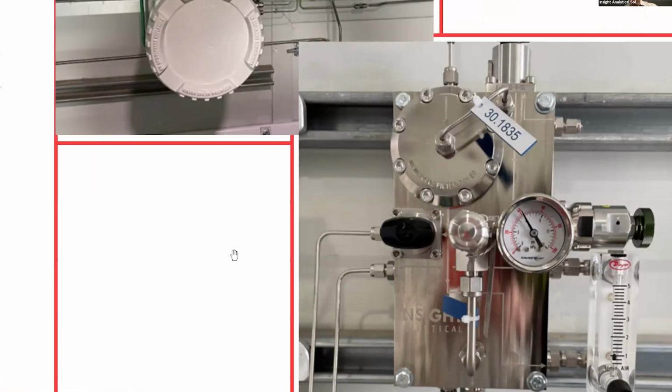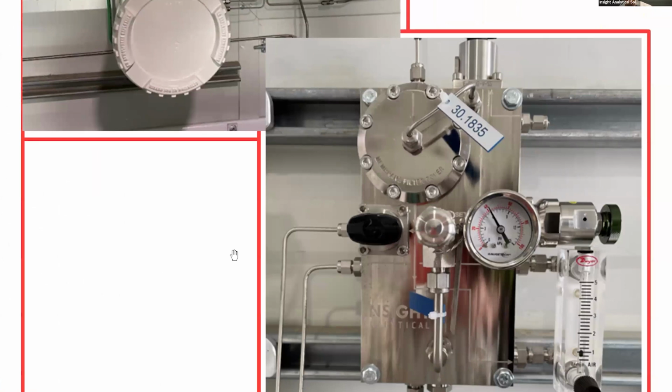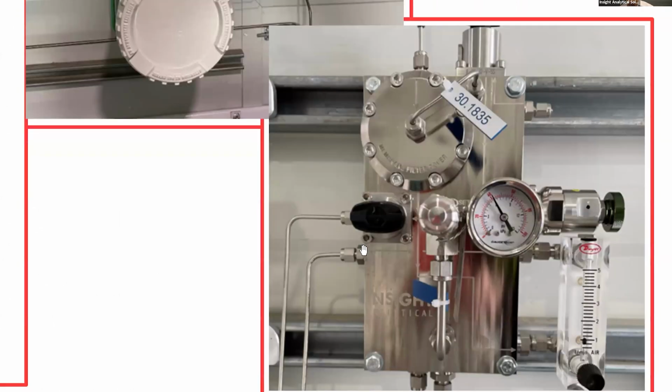So there's the machine sample system. You can see some lines drawn on there. They show the flow paths. It comes in, goes through that membrane filter. There's a three-way valve at the top to select between sample or calibration. The internals of that membrane filter have been designed to give the absolute fastest response possible.